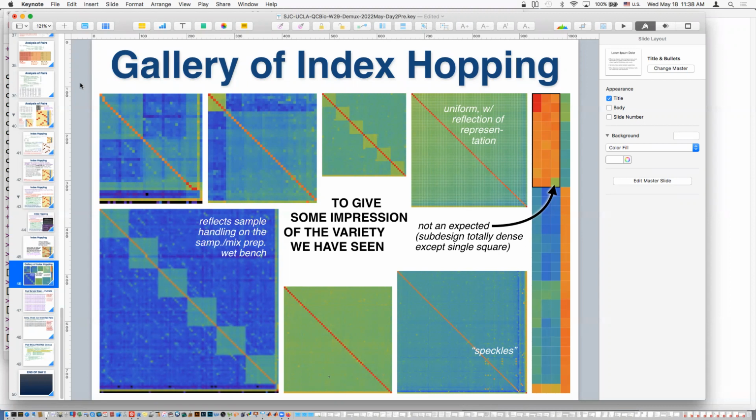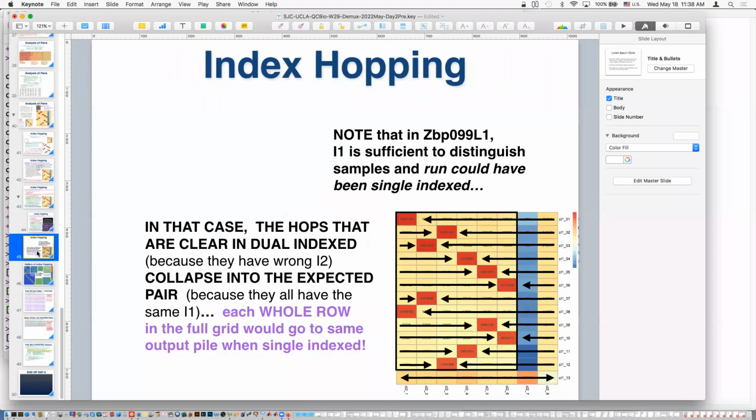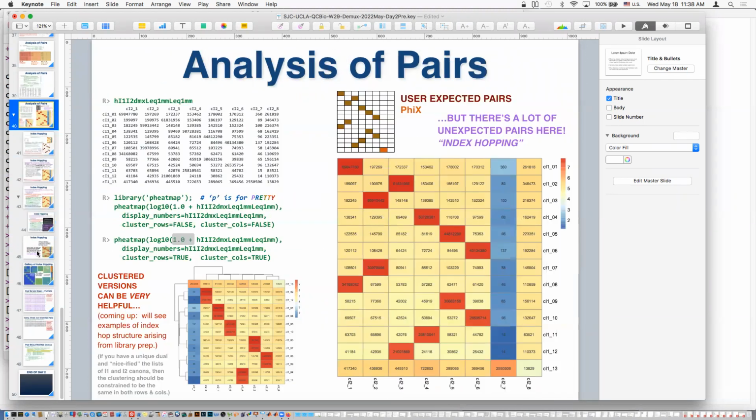I don't auto scale the color scale to start at the lowest number in the square. The color scale is forced to start with purple equals 1. Right. So the fact that this is kind of yellow and green puts it at, this is like the 1% level. I mean, if you look at the color bar for the guy who did make, where's the one where you still have the numbers here?